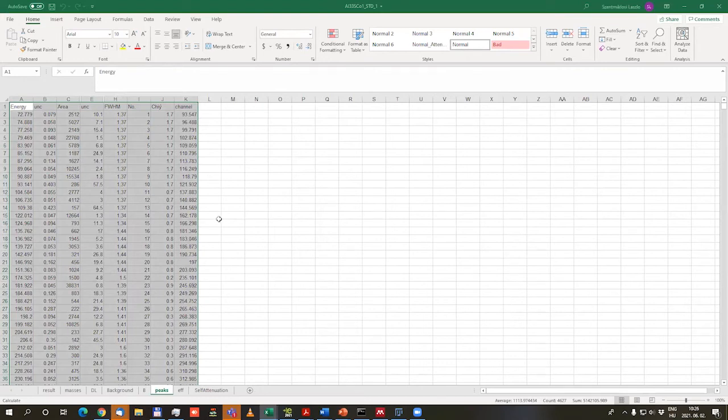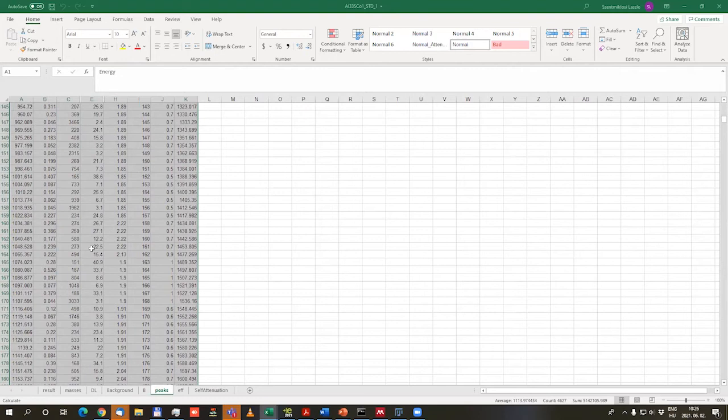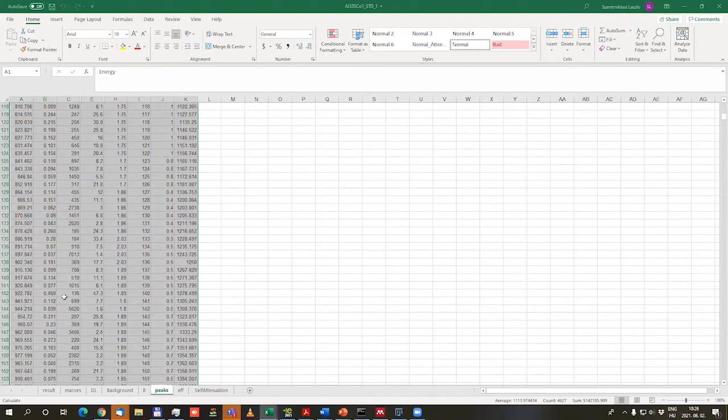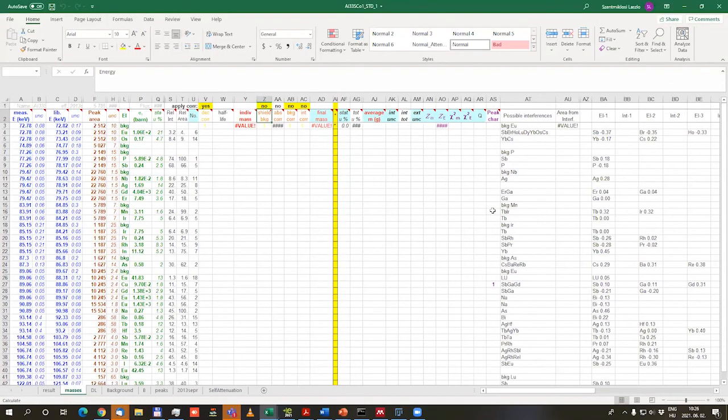So now the two peak list files, the PKL and PKF, were merged together. You see with red which new entries appeared. And then you still have the possibility to intervene and change some entries before we proceed to the identification based on the library. But if I continue running, the program will enumerate all peaks and assign one element from the library.